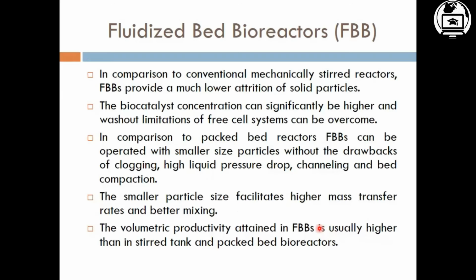In the usual situation in a stirred tank bioreactor, if you use continuous or fed-batch mode of operation, then your free cells can be washed out when you remove your product in order to maintain constant volume. But in case of a fluidized bed bioreactor, this problem of free cell washout can be overcome, and the biocatalyst concentration in the medium remains high.